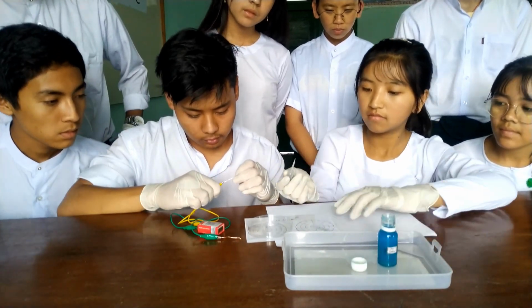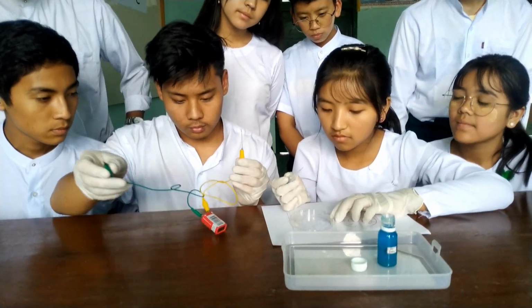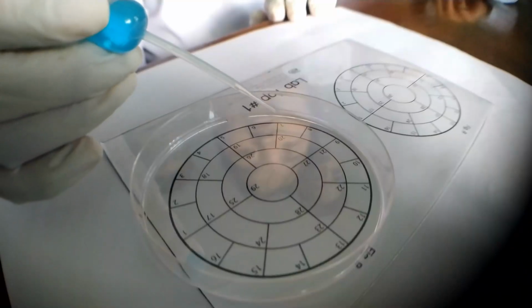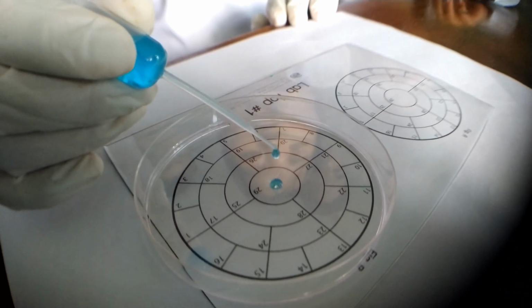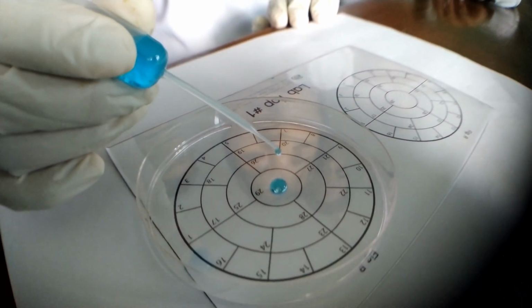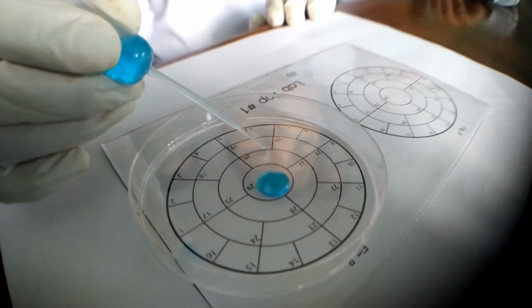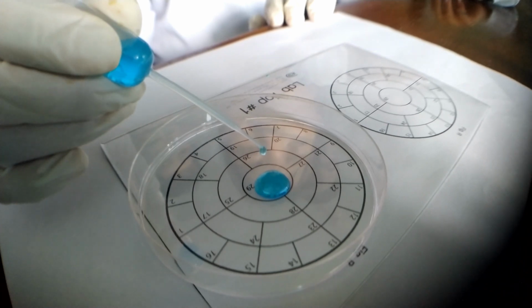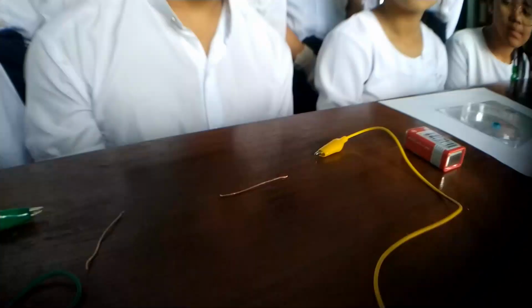And here's the experiment procedure. Before we do this experiment, we need to wear gloves to avoid direct contact with chemicals. First, place the petri dish on figure B of the lab sheet and put 10 drops of copper(II) sulfate at the center, that is number 29, using a microdrop pipette.